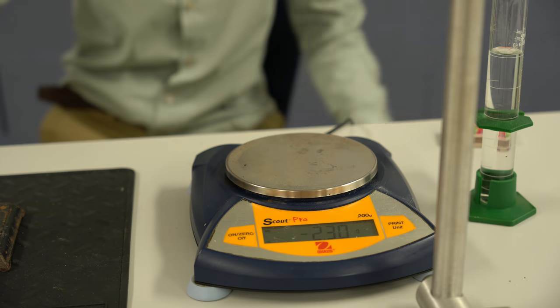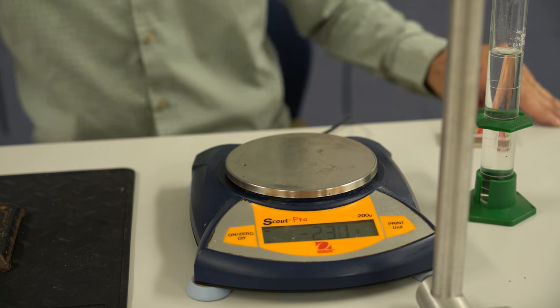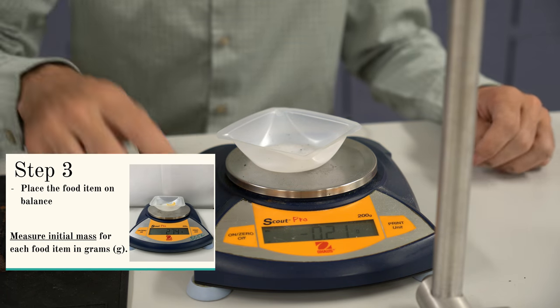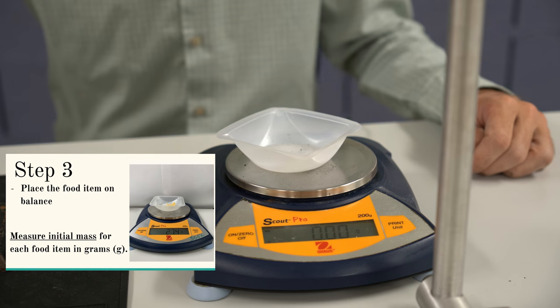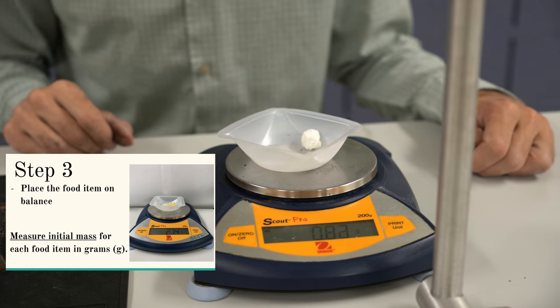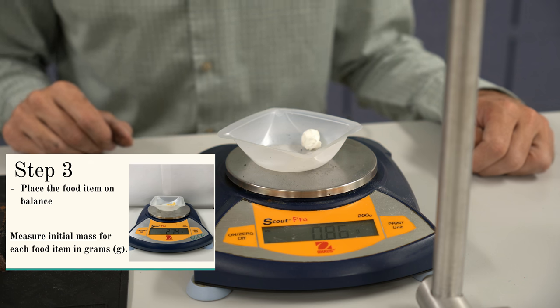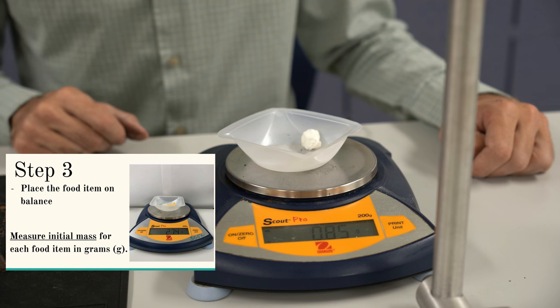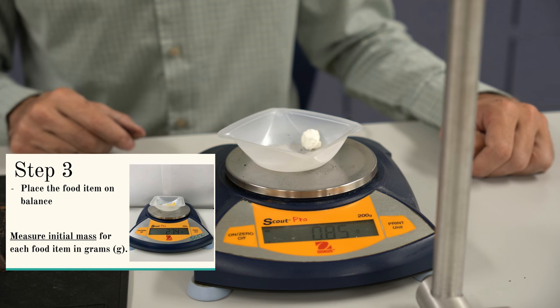Now, how do we get the initial mass of our food item? Well, we take a weigh boat, we put it on our balance, we make sure we let it settle out, we tare the balance, and we put our food item in it. In this case, it's going to be a marshmallow. Here, we're going to take our reading at 0.86 grams. So that's it. 0.85 grams.